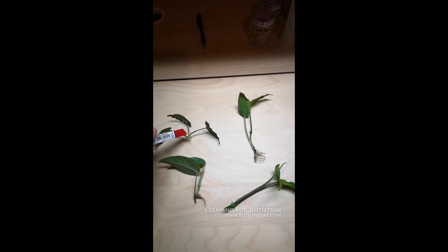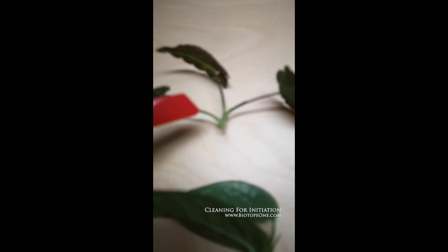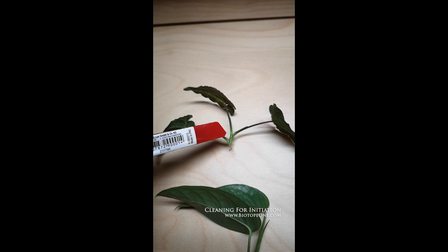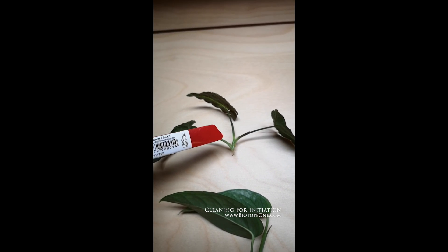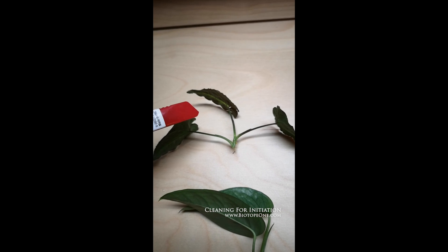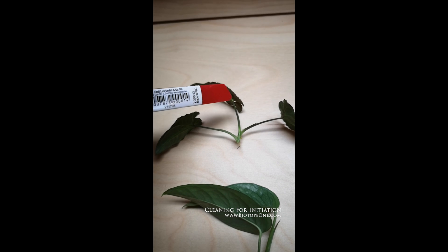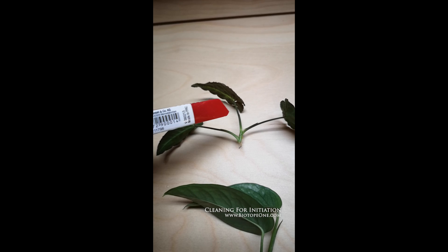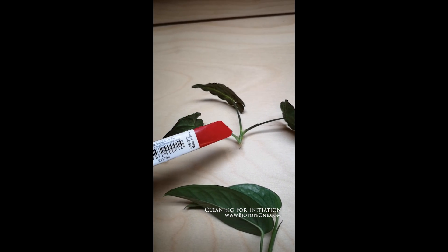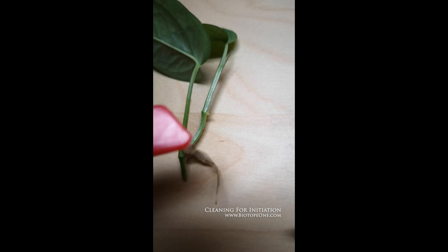You want to cut the foliage off, but you don't want to get too close to the part that you're going to use when you do your sterilization. If you cut it too close, bleach is going to soak in and it's going to end up killing your explant. What you want to do to sterilize initially is to cut them further away, and after they're sterilized you can trim them in a clean hood and cut them down, because it's going to pull into the tissue.